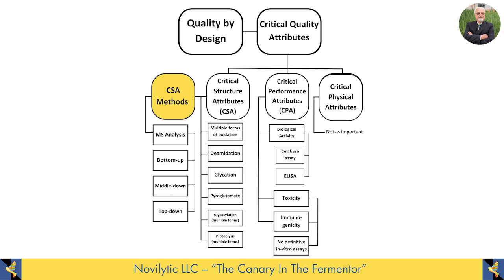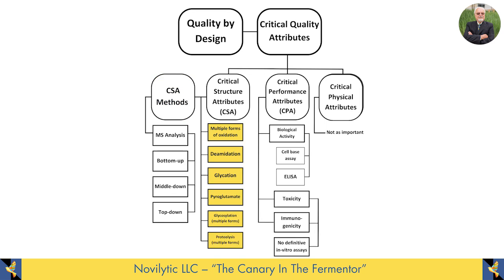And as I said, the way you do that is to take the molecule apart and look to see if it's been oxidized, and all of its deamidation and so forth. That's one way to do it, by taking the molecule apart and looking at all the molecular features. But if you look at all these attributes, that takes a lot of time. In manufacturing, you want to make decisions on whether the process is working and you can go ahead with it based on knowing very quickly whether there's a mistake in the molecule, and that is time-dependent data decision-making.